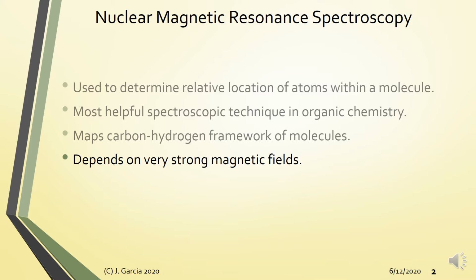Okay? So, NMR, as the name implies, magnetic resonance, depends on the use of very strong magnetic fields. No? Yung concept ng NMR is quite similar to your MRI, no? Magnetic resonance imaging. Okay, so medyo similar sila.